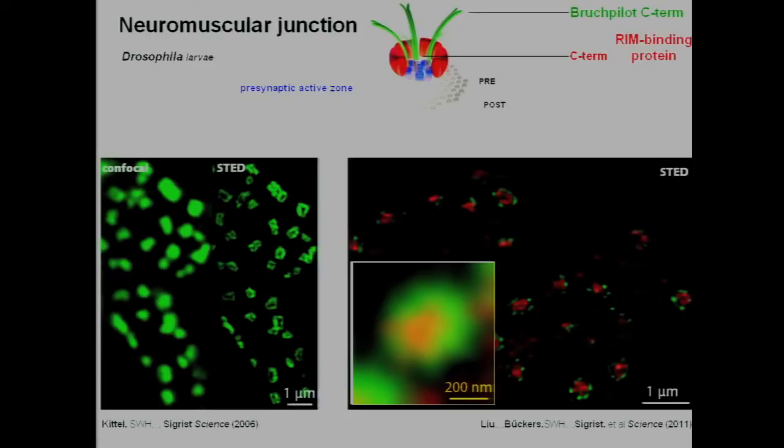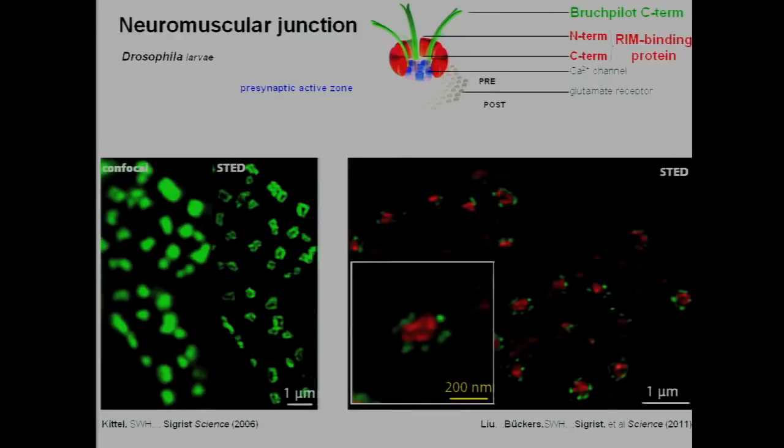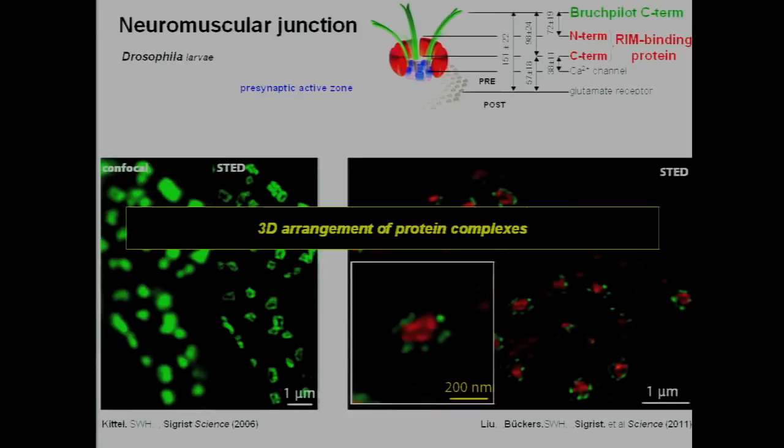And of course, you can do this now with all kinds of proteins. You put different labels on them, and you can, in the end, sort out the distribution of these proteins at a nanometer scale. And this is kind of interesting because look at the numbers here, 50, 30, 70, 80, 100 nanometers. This is far below the wavelengths of light, which in this case was 700 and 750 nanometers. Still, we can sort it out because we have a spatial resolution beyond the diffraction barrier, despite the fact that we use focused visible light. What helped us to get there? The transition of the molecules. The molecules helped us see features sequentially by shutting some of them off.